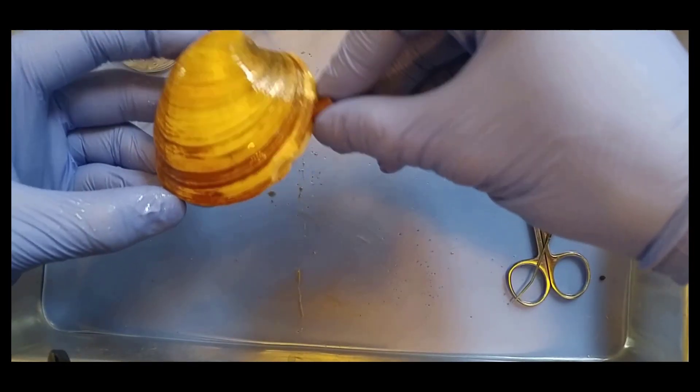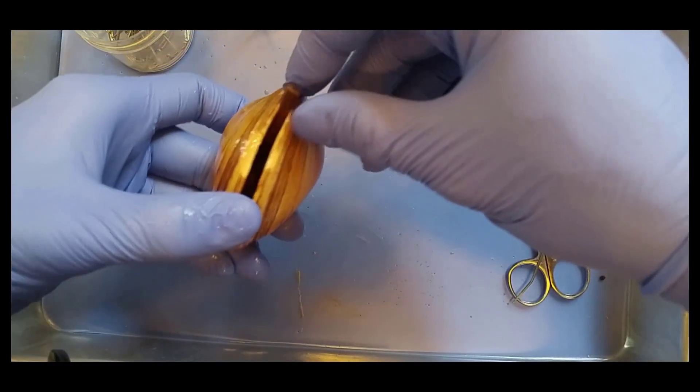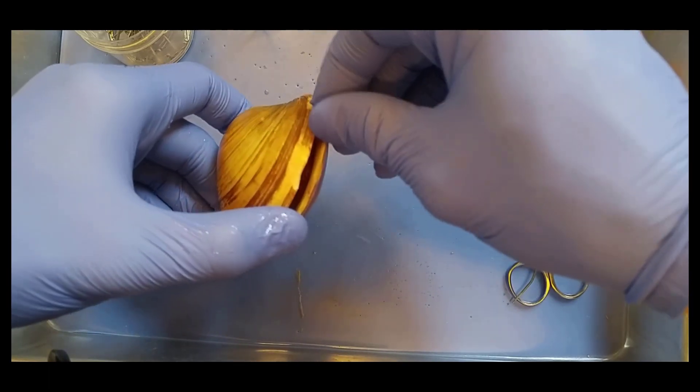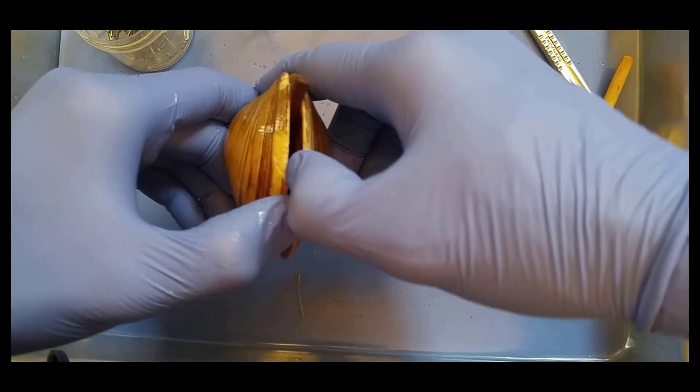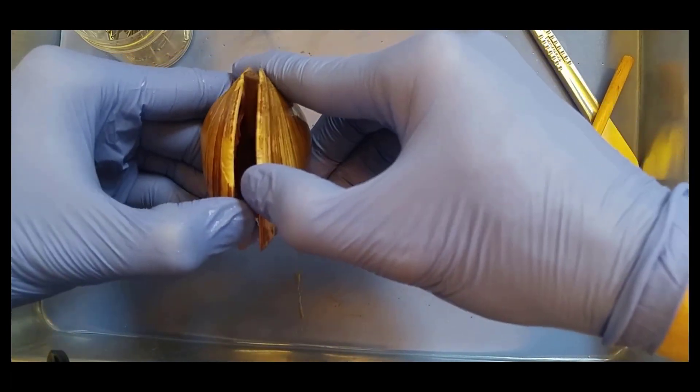Good afternoon. Today we will be dissecting a clam. I've got two special helpers here. Want to introduce yourselves? Jack. And Charlie. And they're here to help me look at this clam.